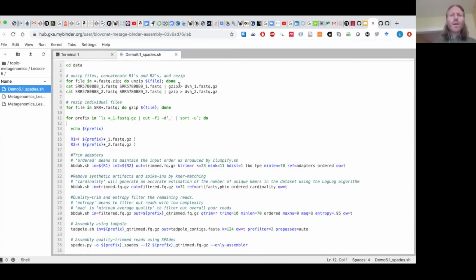Okay, so due to the limitations of the binder format, which involves low amounts of memory, you can only use about 2 gigabytes of RAM before it kills your process. We're going to do an assembly of a genome and not a metagenome. Metagenomes typically involve very large sequence files and a lot of memory to be used, especially if you're doing error correction.